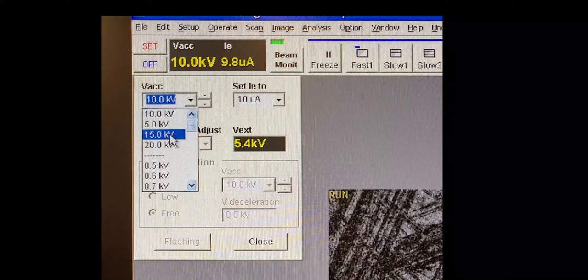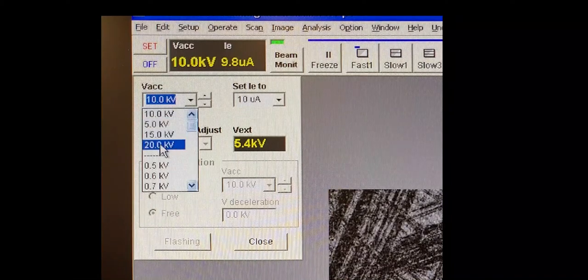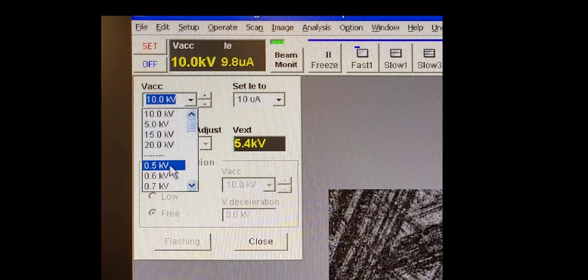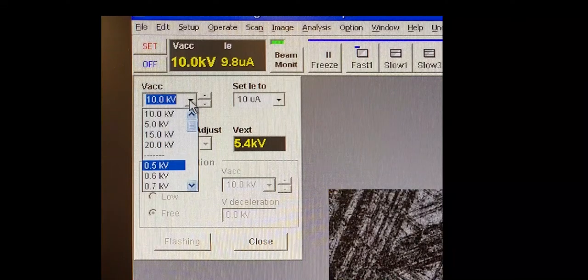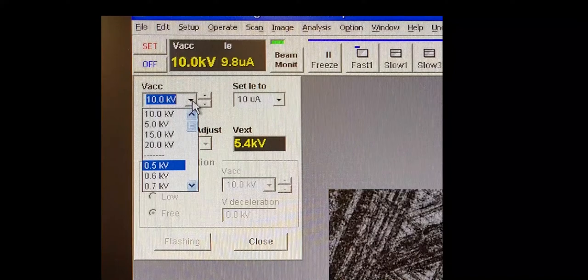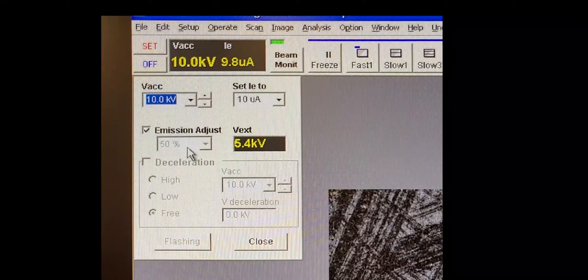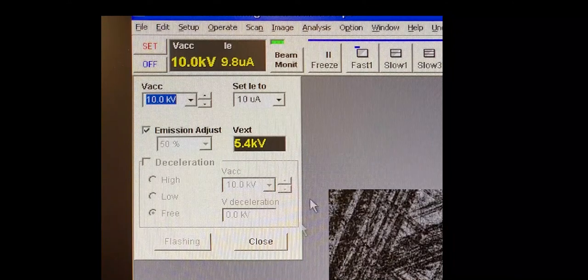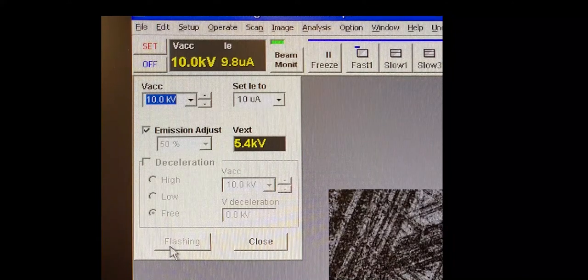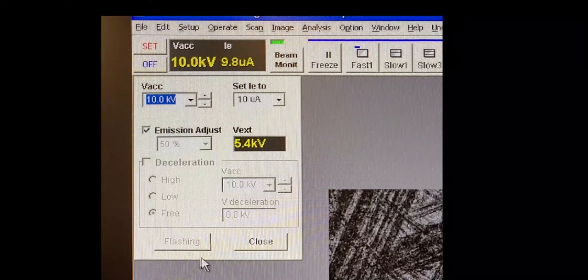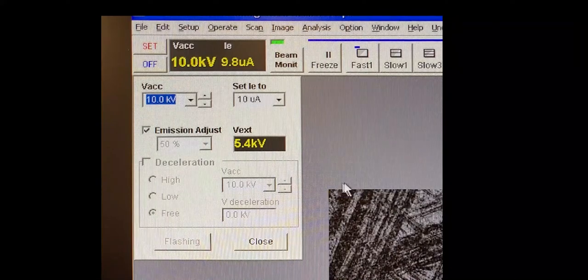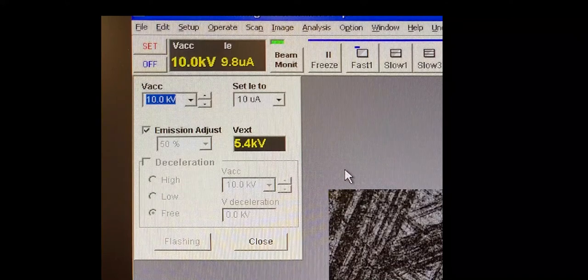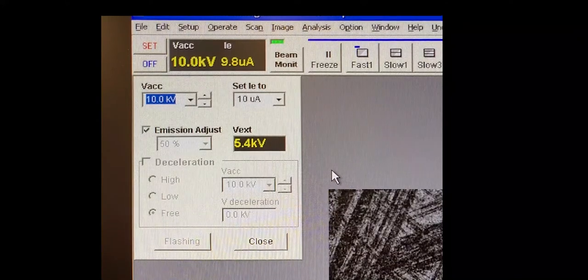If your sample has charge sensitivity, you may start at five. And just so you're aware, we can go even lower than five if needed. Make sure the emission adjust is checked. It should be at 50%. We don't usually change that. If the software ever asks you to flash the tip, you will turn off the high voltage, press the flashing button, and then execute. Once it's done, you can turn the voltage back on.